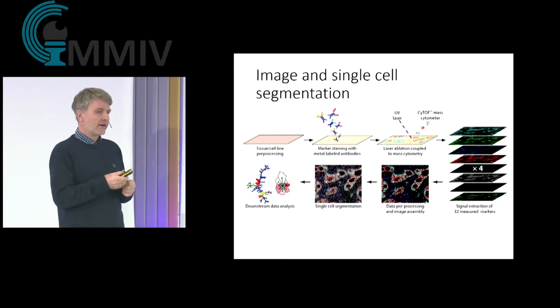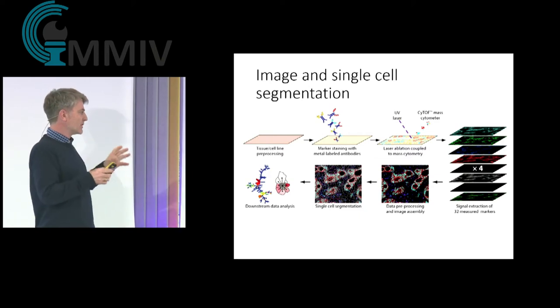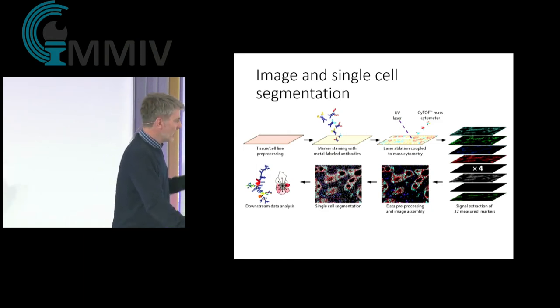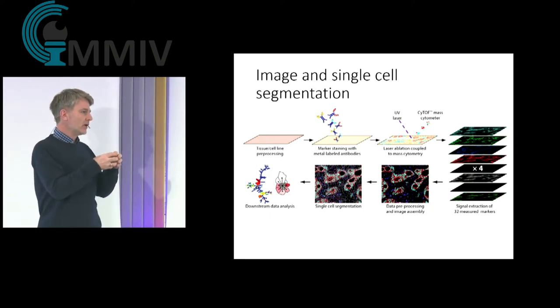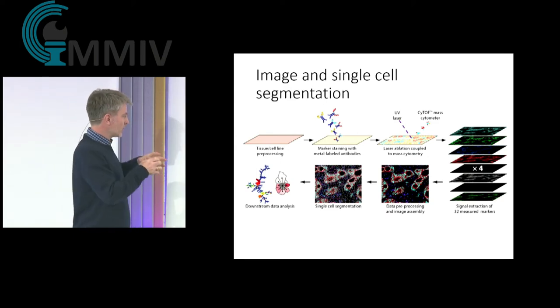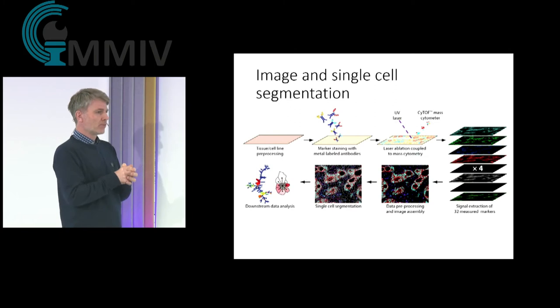But the cool thing here, and I can't say this enough, is that you now have the ability to segment the cells, take all the cells out from the tissue, and look at one cell at a time, as you do in flow cytometry. And the cool thing with that is that you then have the possibility to use all the flow cytometry software and programs that we have.